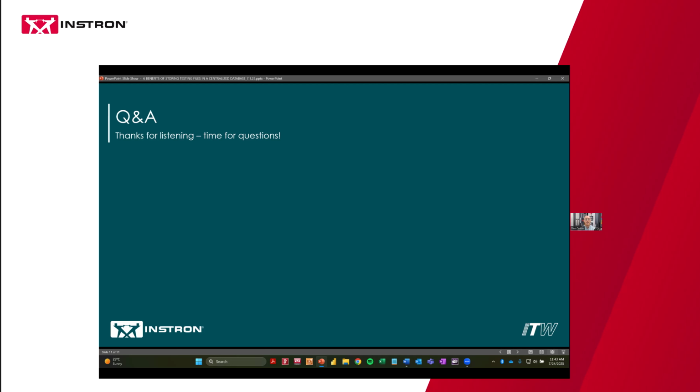The next question is, is Bluehill Central cloud-based? So I'll answer that by saying, just like Bluehill Universal, it's a desktop application. The Bluehill Central viewer clients that I was showing some snapshots for, and even the server application that's running on the database, are traditional applications that are installed on a computer.